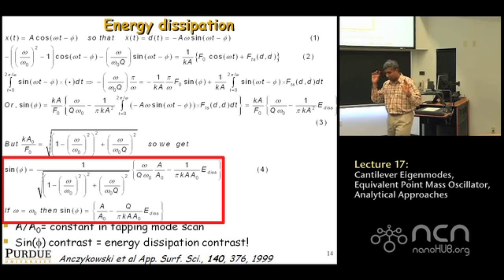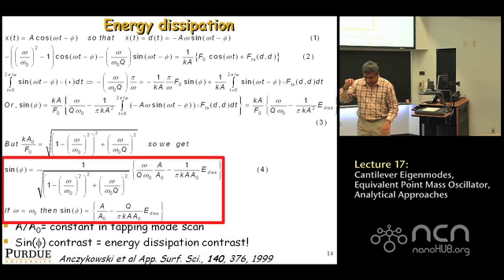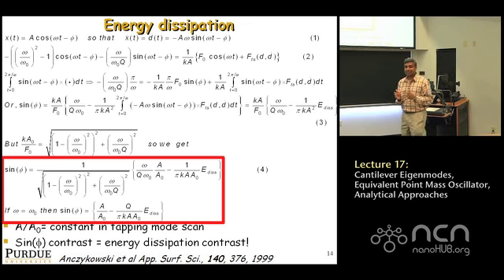Right? So all of us know how to measure energy. We take a ball, let it go, it bounces, and due to contact it doesn't go back to the same height. You've lost energy in the impact, right? That's with a tennis ball, let's say. This is the smallest mechanical ball that is tapping, moving away, and you measure the loss due to the interaction between a few hundred atoms and a few hundred atoms on the sample. It's amazing if you think about it, all right? That's the E-dis, energy lost to the sample in one cycle of oscillation.